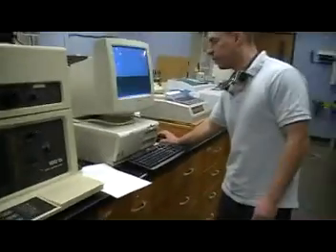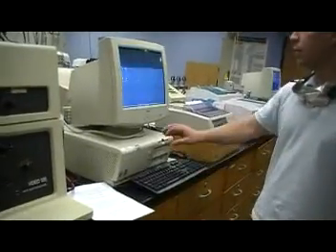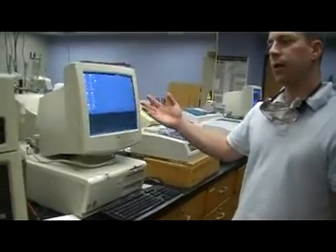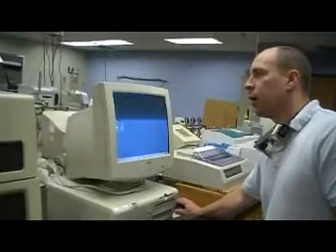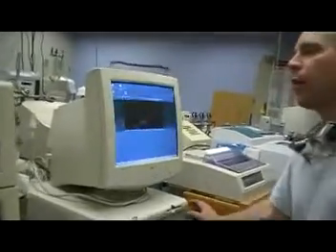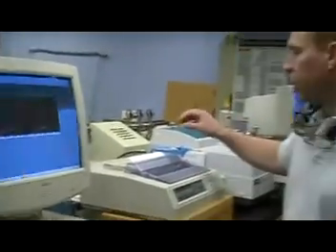We also have the computer set up. If you set up this correctly and you hit enter after hitting read, it usually collects data. In this case, it froze, and so you need to open this up again, open the software up so that you can record the values recorded by the instrument, and they'll be printed off on the paper.